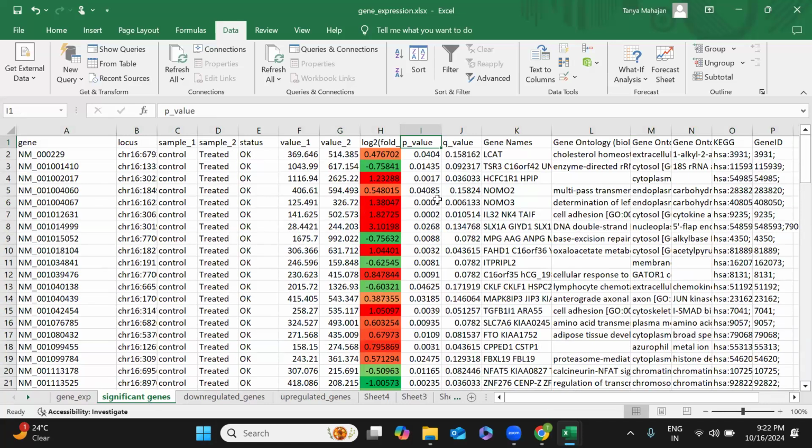Okay, yes, ma'am. So not for the upregulated and the downregulated. Sometimes it's a confusion that maybe the positive value is considered as upregulated and the negative value is considered as downregulated. Is it right? Yeah, this is right, because we discussed this log2 fold change in the last session, why we say the positive as upregulated. Okay, ma'am. Thank you.